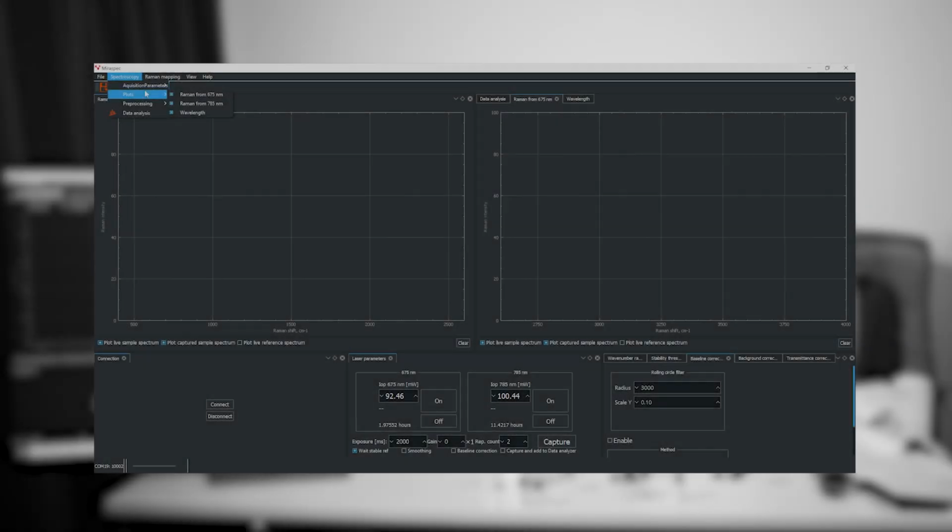You have a question? No? Yeah, maybe later. Are they working at the same time? No, one after the other one. Sequentially. And by the way, you should not worry. You can turn on another laser, the previous will turn off by itself. Okay. So you don't need to turn it off, and you can just switch.